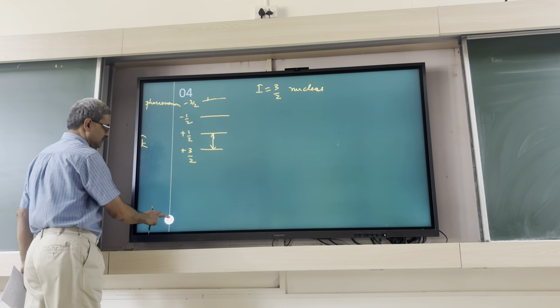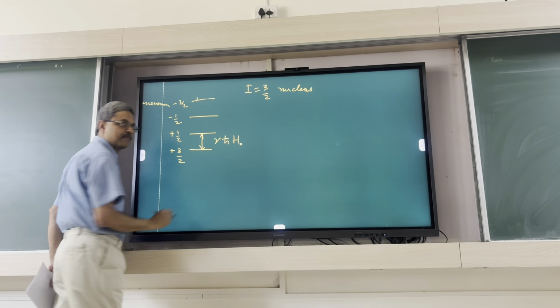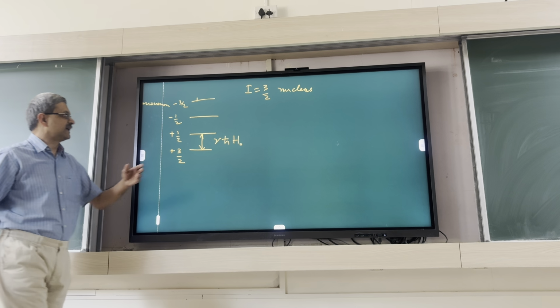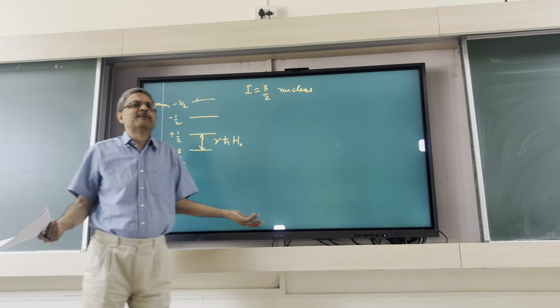To get some nuclear level of splitting, finally we need some kind of order of Tesla magnitude of magnetic field. So you're asking what's the value of the field we can have? Roughly, in principle, anything.